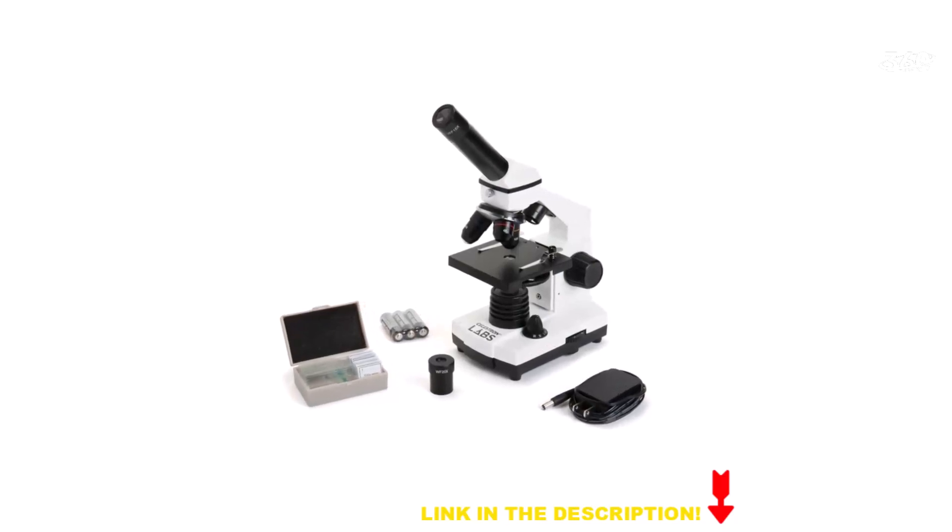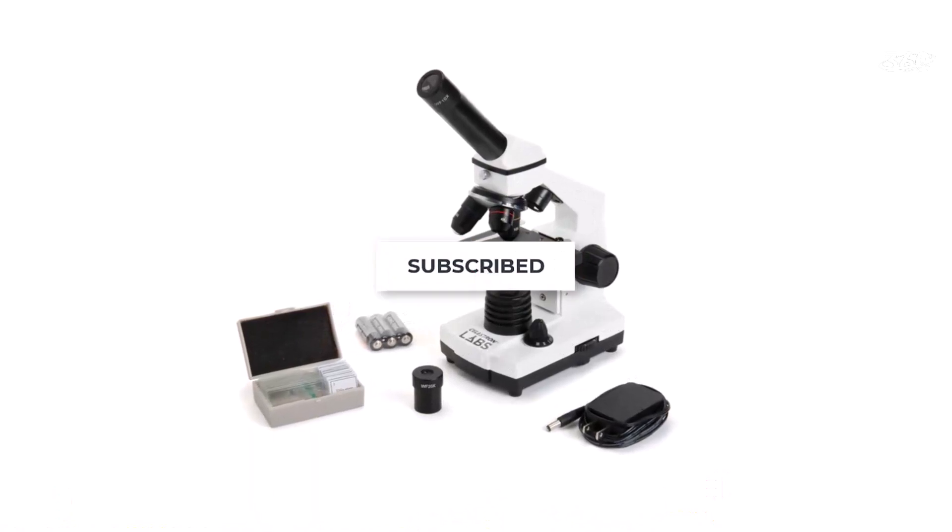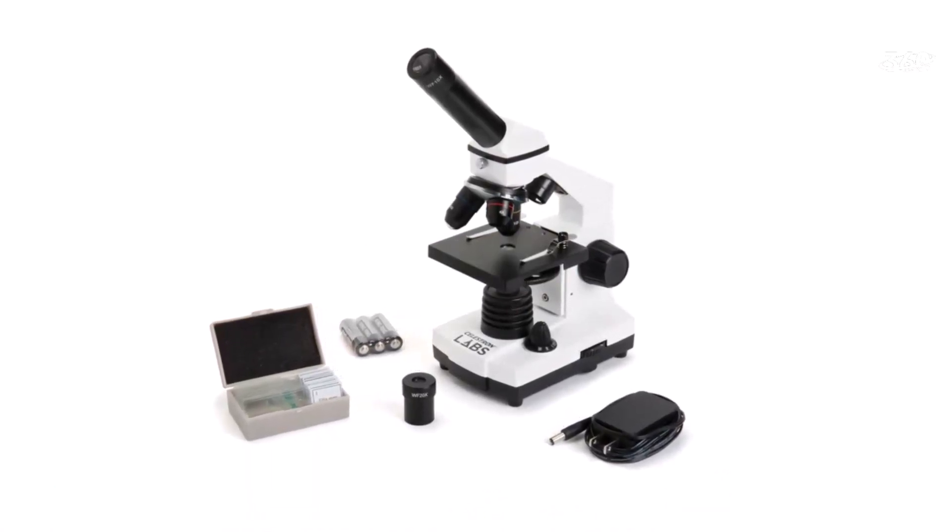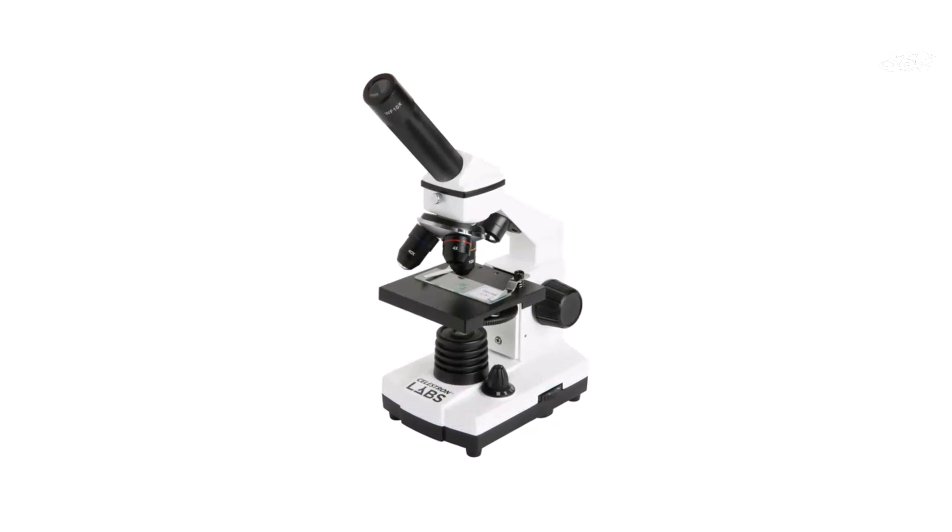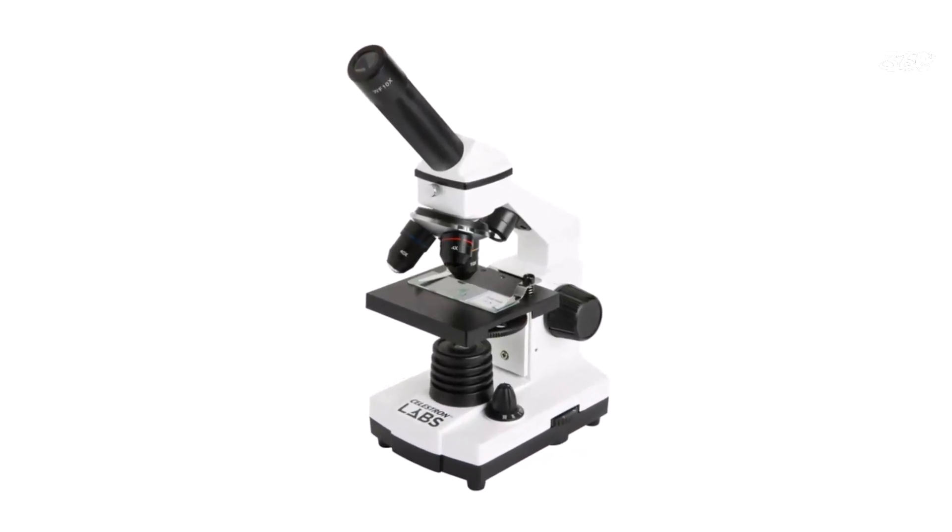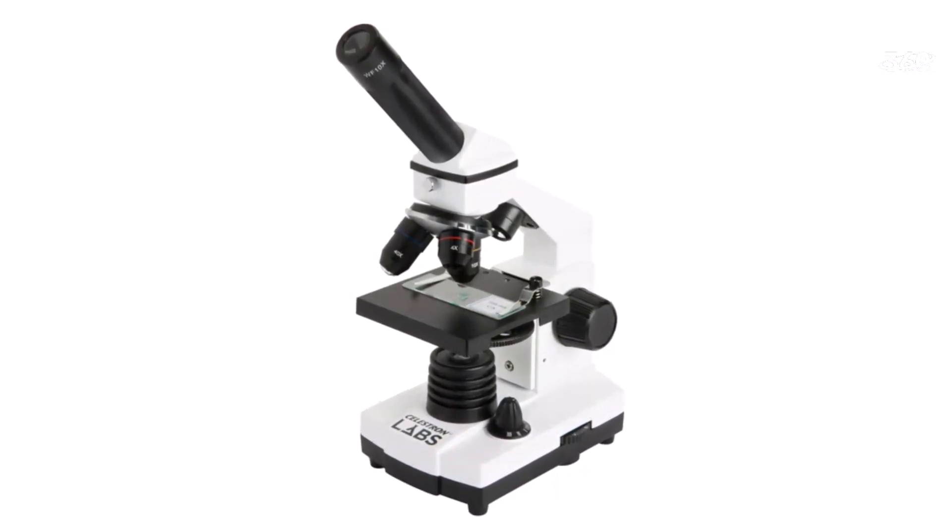This allows you to control the brightness and focus of the light source, ensuring clear visibility of your specimens. The adjustable illumination is particularly beneficial when observing translucent or transparent samples, as it helps to enhance contrast and details. The Celestron CM800 comes with the convenience of battery-powered operation.